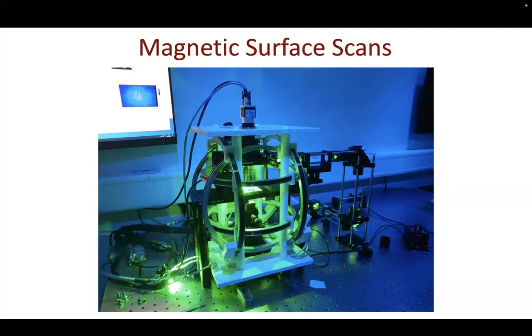So let's have a look. We've already seen this thing earlier today. This is the one in Utrecht where we have it up and running right now. My usual summary of this machine is that it combines a microwave, a diamond, and a laser to measure magnetic signals, and that's usually enough to spark the interest of our students. For the technical details, I refer you to the poster by QDMIO later today.